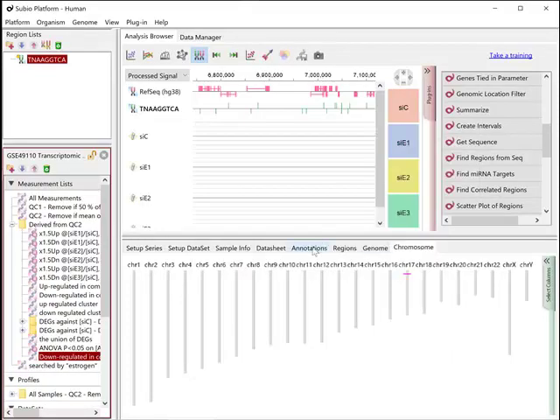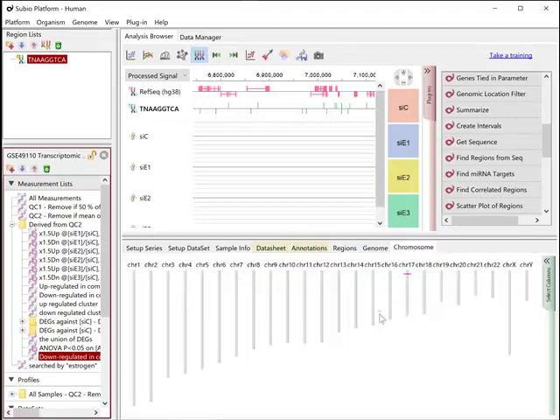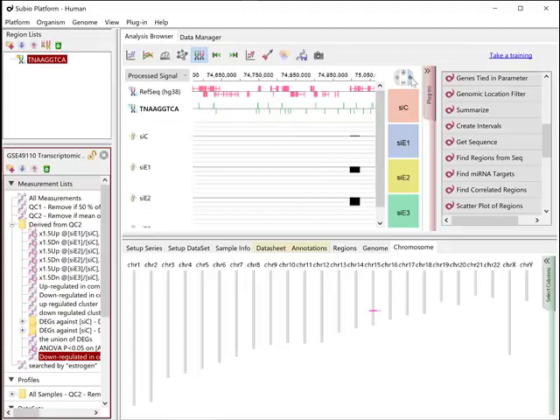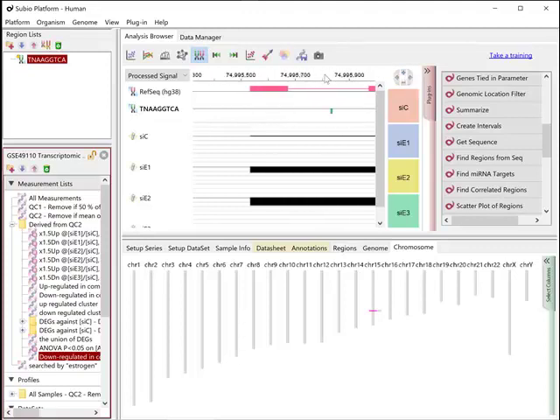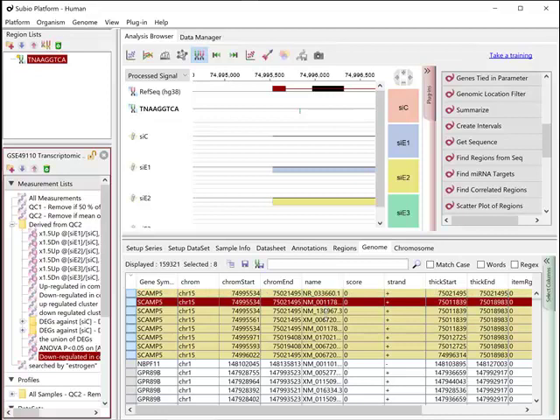Make the gene selected to find its location with the Chromosomes tab. Let's closely look at around the promoter region of the gene with the genome view. The consensus sequence looks at a bit downstream of the TSS, on the complementary strand. If you look at the transcripts of the gene, there are two that can have the consensus sequence at their upstream of TSSs.